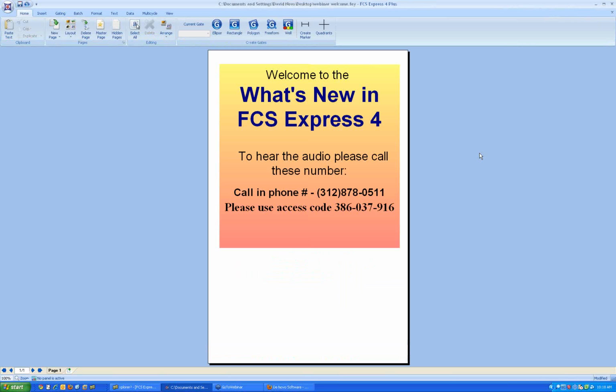So with that preamble done, does anybody have any questions so far? Feel free to ask any questions before I begin on the actual nuts and bolts.